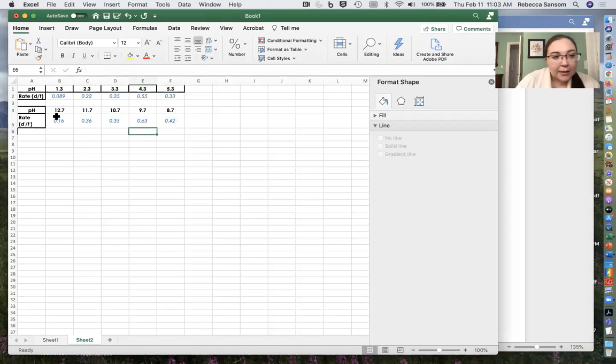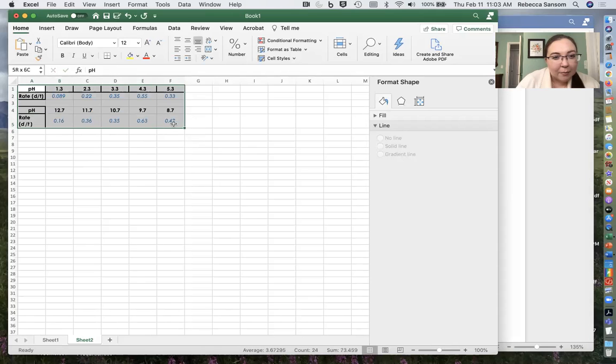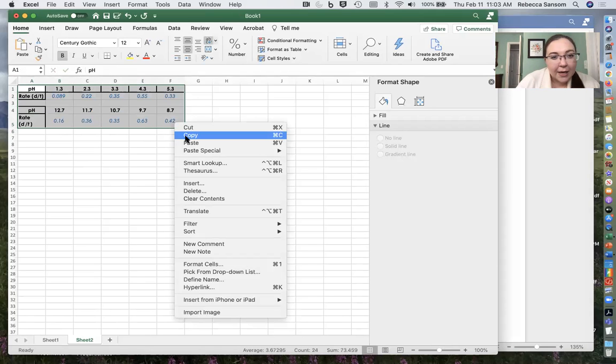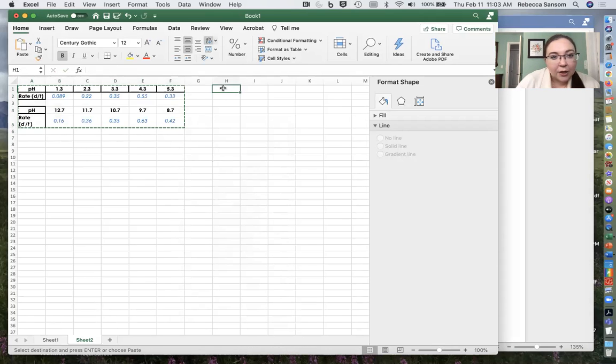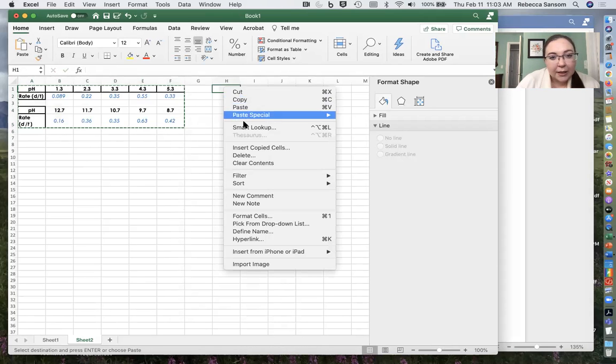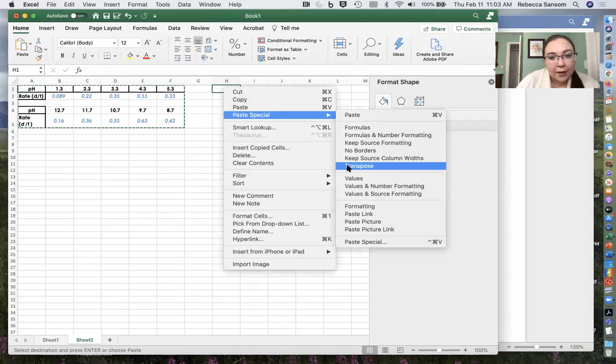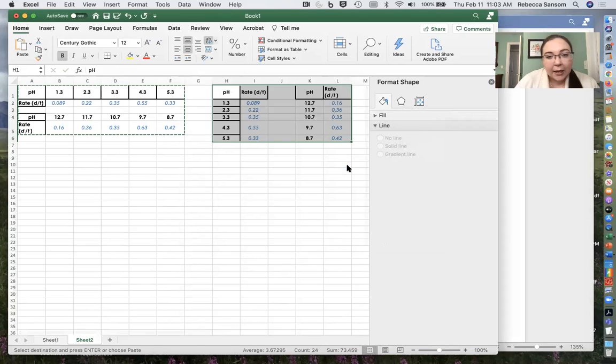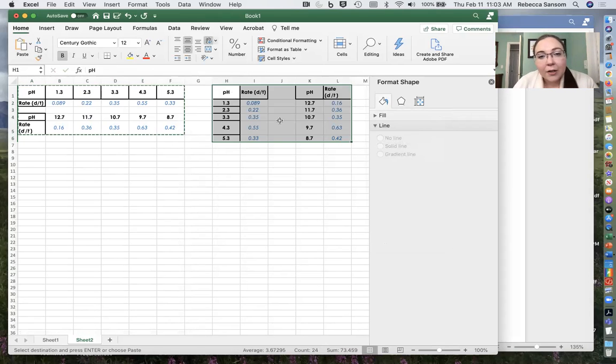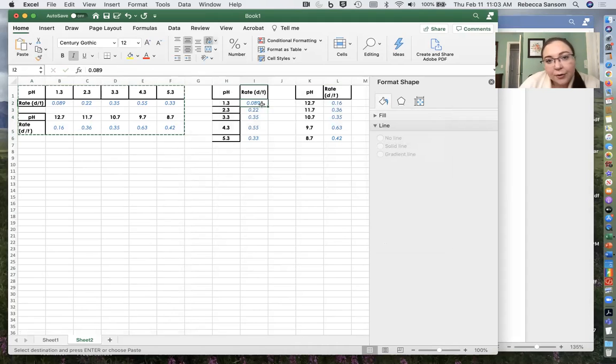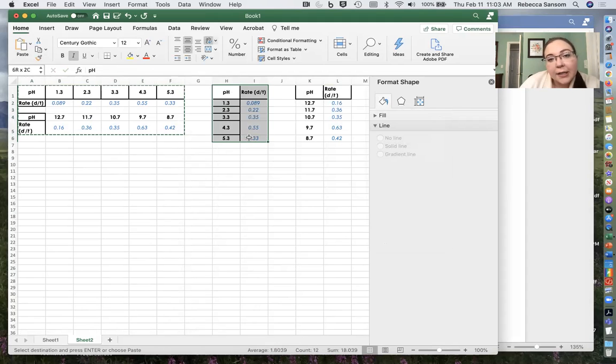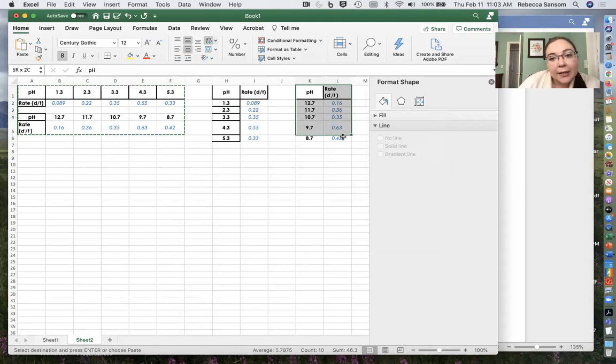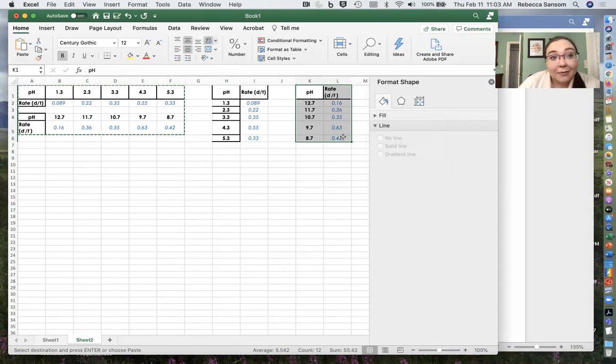Okay. And now what I'm going to do is I'm going to take all of this stuff and I'm going to copy and I'm going to transpose paste it here as well. So paste special and then transpose. And now I've actually got two data series. I've got this data series that's for my acidic stuff, and this data series that's for my basic stuff.